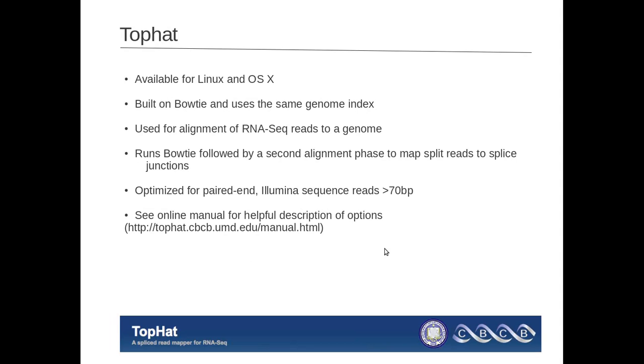Top Hat, again, is the alignment step in the RNA sequence analysis workflow that we're using.